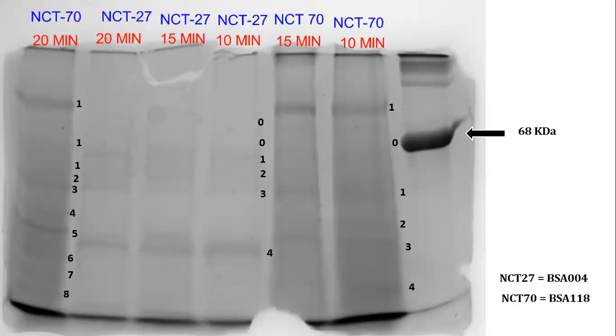Or I want to distinguish among the 6 strains how many unique species of Bacillus there are. So what I do, I will dissolve each and every bacterial biomass in the loading buffer of SDS-PAGE. I will heat it up and load the sample. What I'm trying to do is to study the profiling of the bacteria, the physiological proteins. I'm trying extracting them and profiling them in SDS-PAGE.